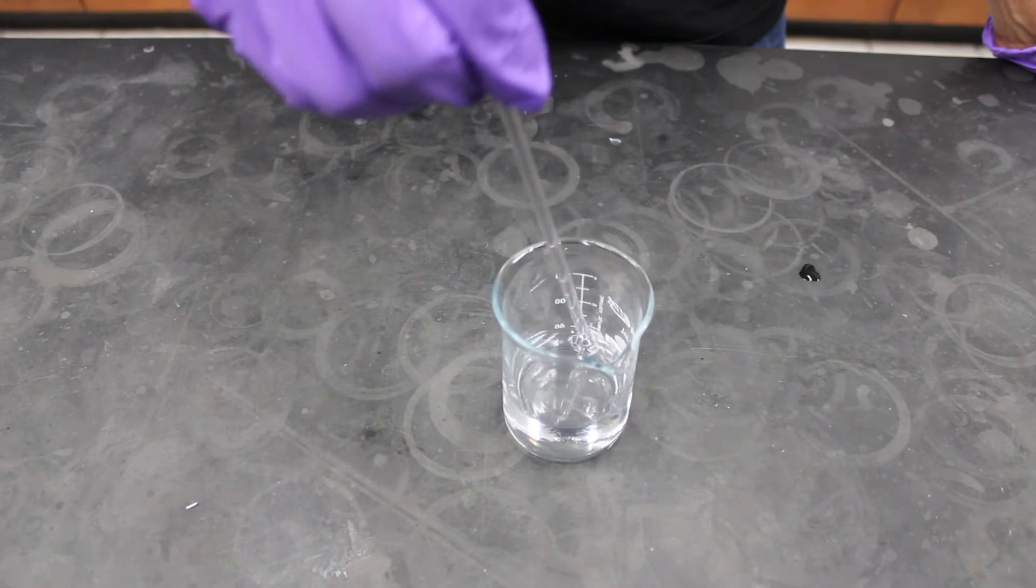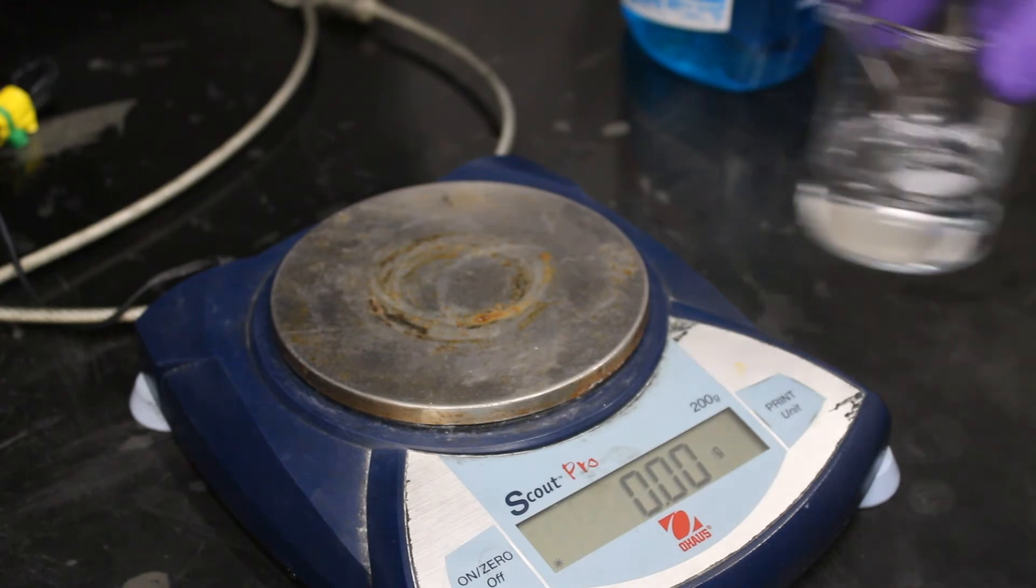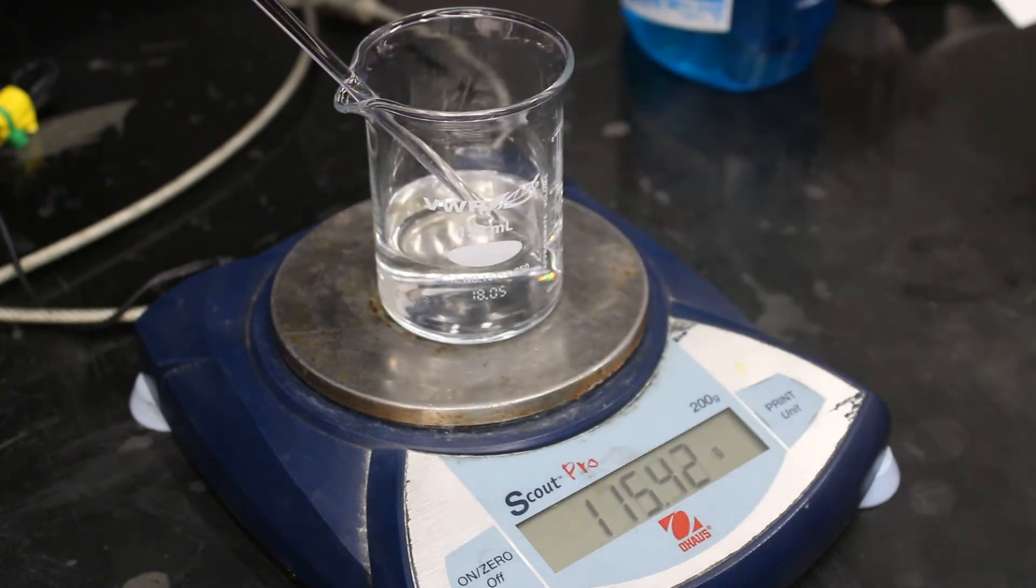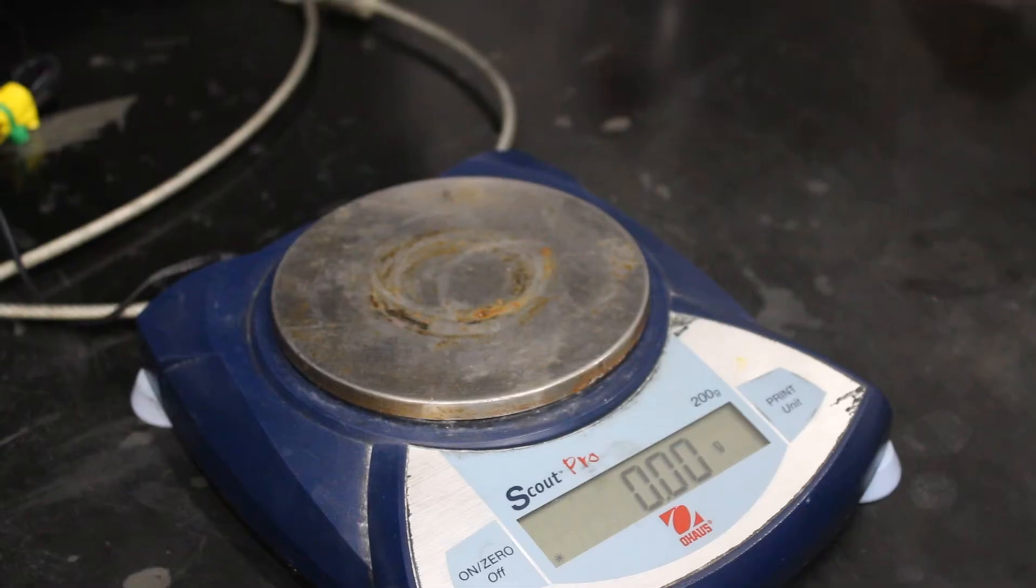Once the citric acid is completely dissolved, measure the mass of the beaker, solution, and the glass rod. Once you use your glass rod, it shouldn't be removed from the beaker because it will affect the final calculations. Note down this reading in your lab manual to the correct number of decimal places in grams.